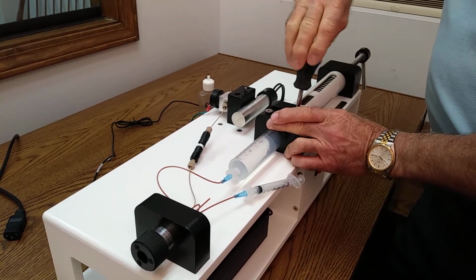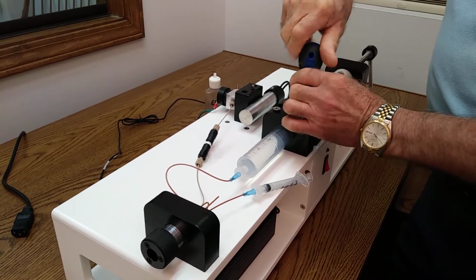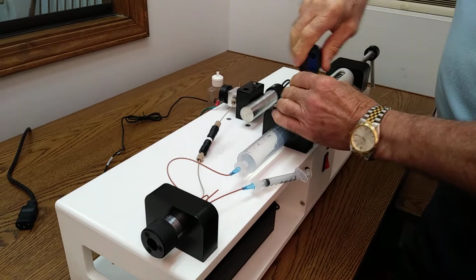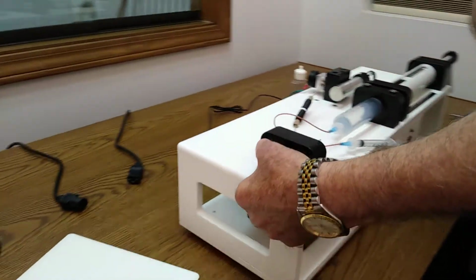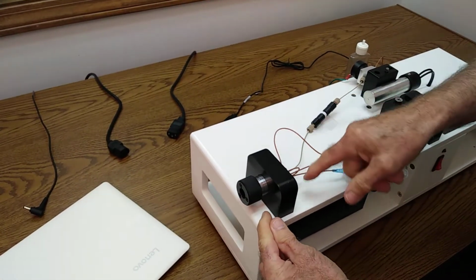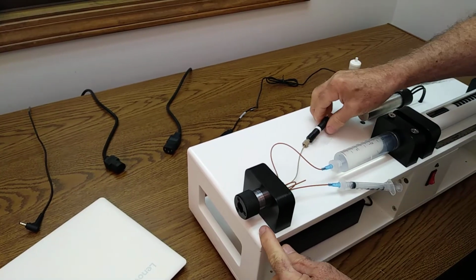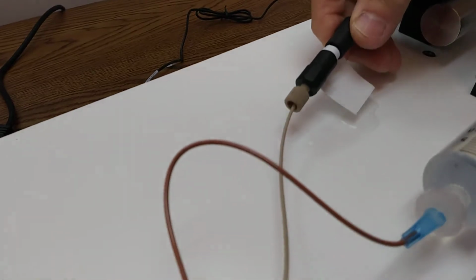There's that one. Here's this one. Going, going, going. Finger snug. Now we rotate the injector back toward the front. So we're now flushing beside the loop into the column. You can see a little puddle forming underneath the column, and it's dripping gently.